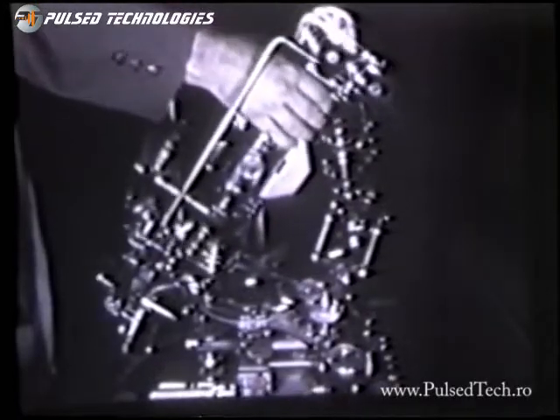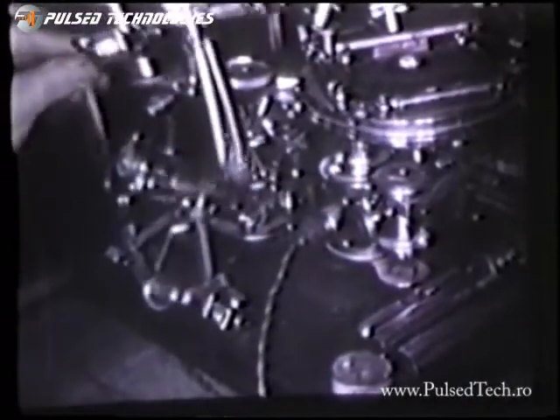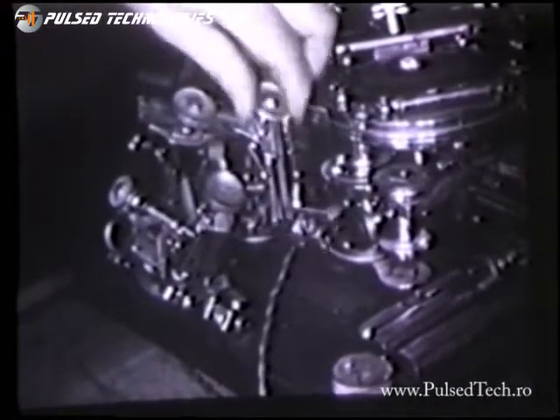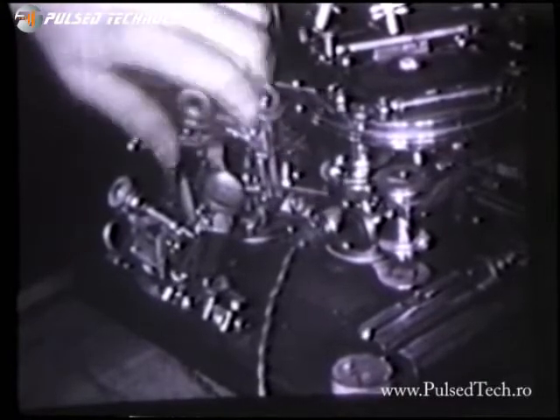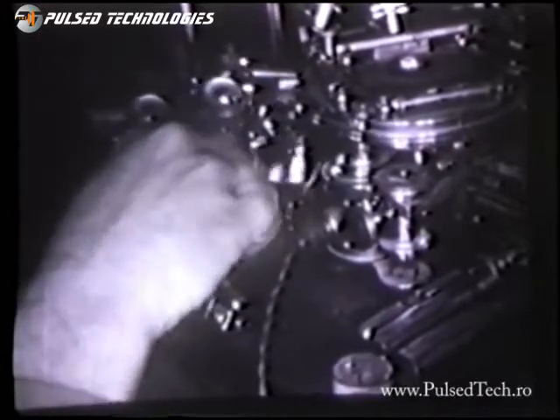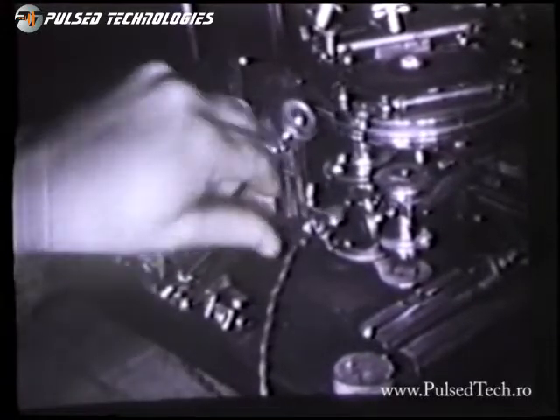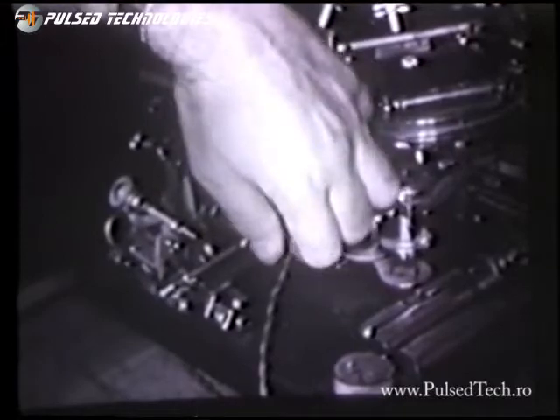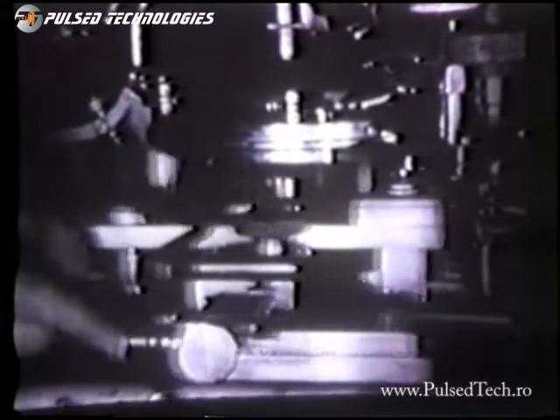The microscope was also used for measuring the angles of crystals in crystallography. As you can see, it can be rotated through 3 planes, and the slide can be moved back and forth, up and down, in and out, and whatever angle it needed to be measured could be measured with a protractor indicator on the back of the microscope at the top, which was also coordinated with the angles of the movements that you just saw.